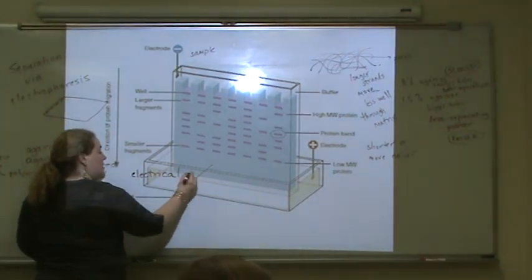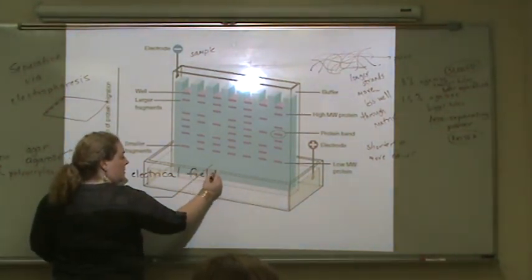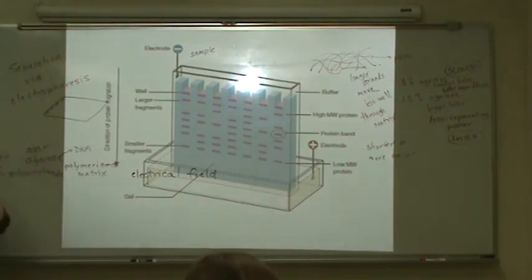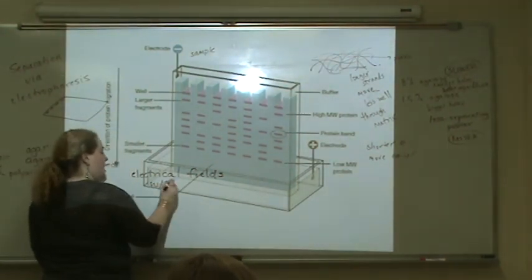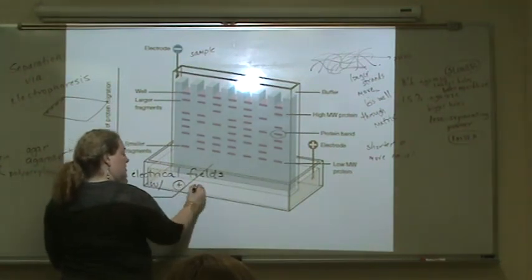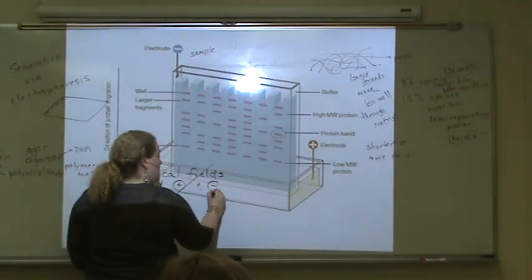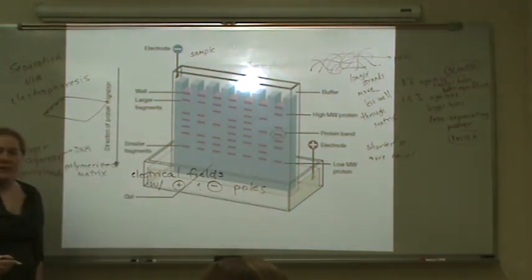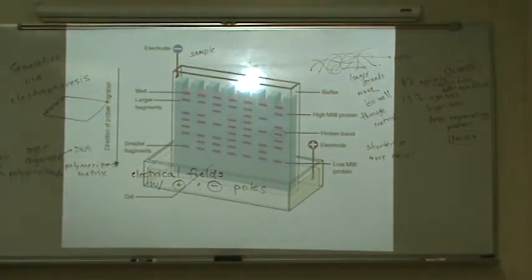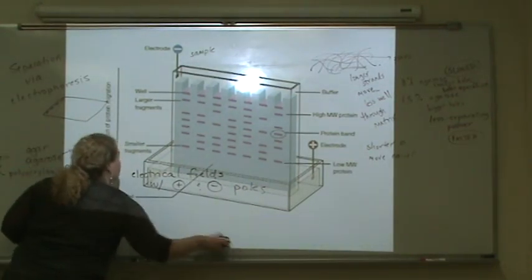And they're named such because these gels are placed into electrical fields that have positive and negative poles, kind of like the positive and negative end of a battery. These electrical fields have positive and negative poles.